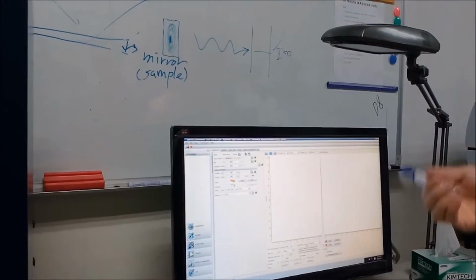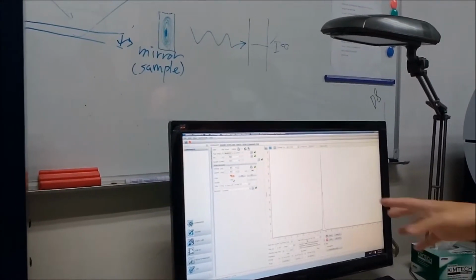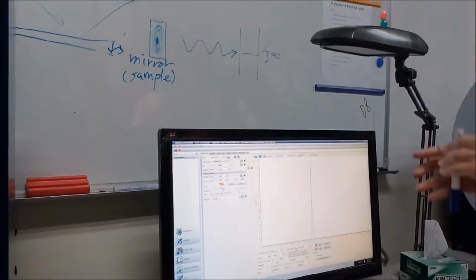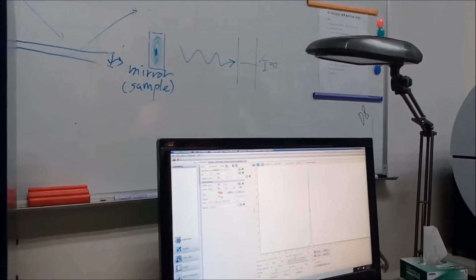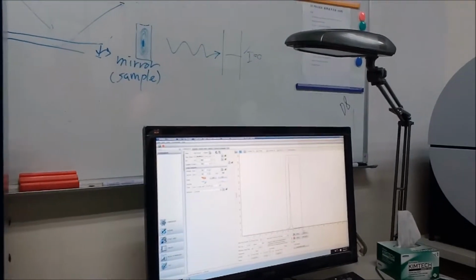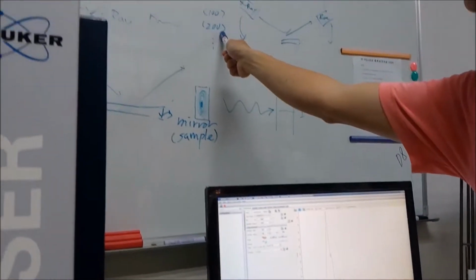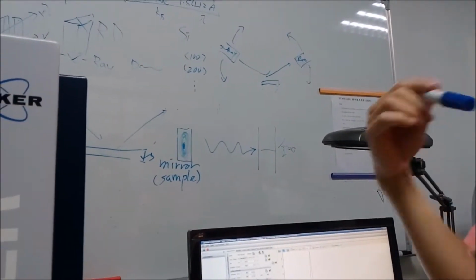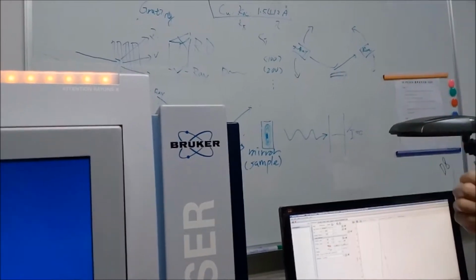But in other labs like ours, we synthesize a new compound, so we scan very carefully, because we need to know the different diffraction patterns between samples. The diffraction peak comes from the crystal phase, and the different crystal phases need to be shown by the powder pattern, because we need to let all of the crystal phases show.